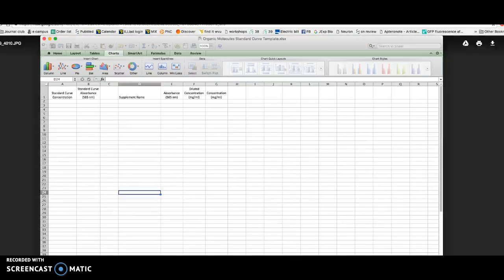So when you plot this standard curve and plug in the absorbances of your supplements, you're actually getting the concentration of protein in the diluted form you created, right? So this is where those values go. But we need the concentration of protein in the actual solution, right? If you know the concentration of protein which is 10 times diluted, you can calculate the concentration of protein in the undiluted mixture also, right? We used C1V1 stuff. So do it, and that's how you're going to get the concentration.